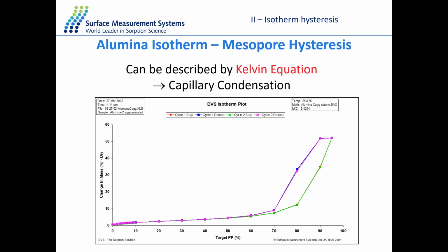What I mean by mesoporous material is a porous material that has very large pores that can contain multiple molecules of water. So think about this sample as a giant cage. What we are looking at here is more of a honeycomb type of structure. There is a lot of empty space. The structure of the sample is mainly empty. What you're looking at as a solid part of the structure is only the corner of this honeycomb shape.